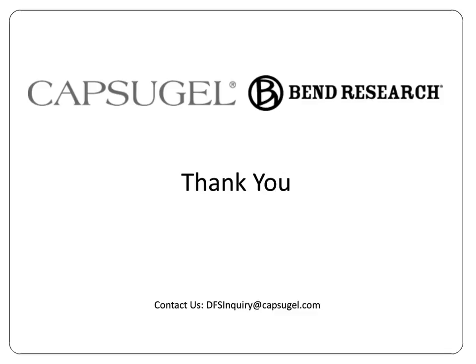However, as I mentioned earlier in the talk, one of the things that we're working on, and one of the things that systems identification is really good at, is expanding that to being able to manipulate multiple variables simultaneously. And so that's where we really see the time savings over what's being done currently: a big time opportunity to manipulate multiple variables simultaneously and then pull predictive models out of that data.